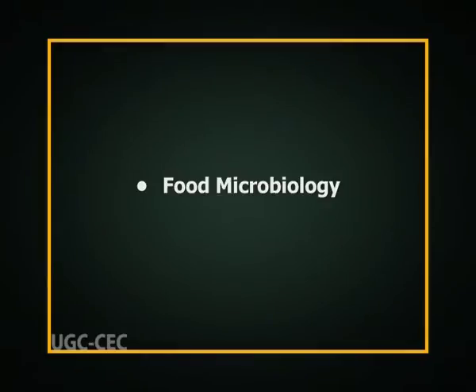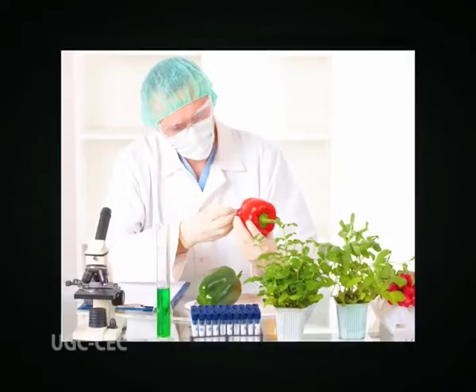Now friends, let's learn about the food microbiology. The examination of food for the presence, types and numbers of microorganisms and their products is basic to food microbiology. In spite of the importance of this, none of the methods in common use permits the determination of exact numbers of microorganisms in a food product. Although some methods of analysis are better than others, every method has certain inherent limitations associated with its use.